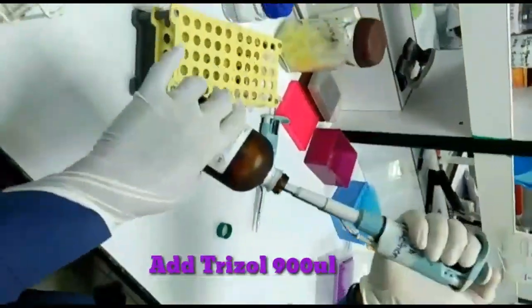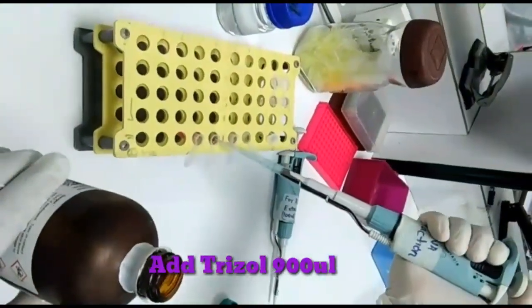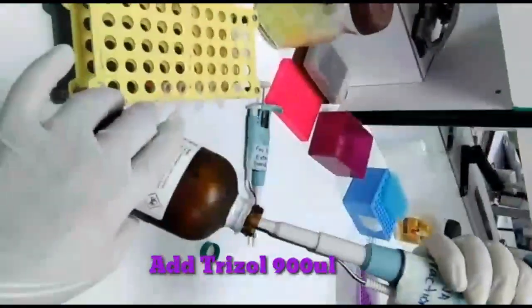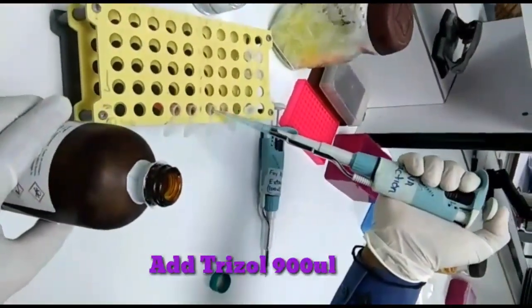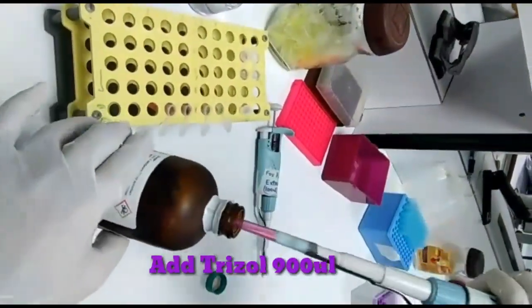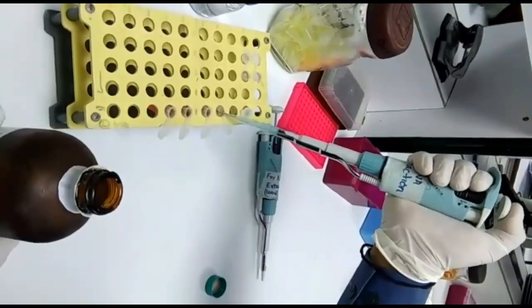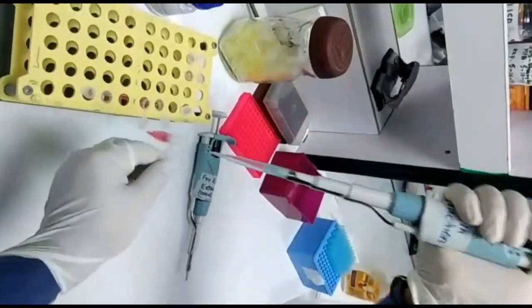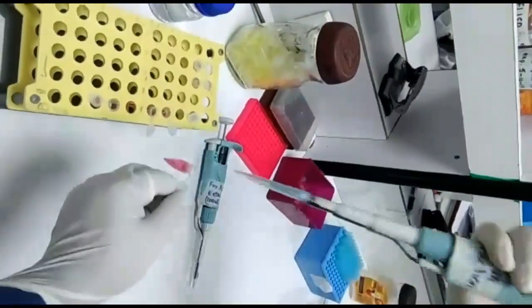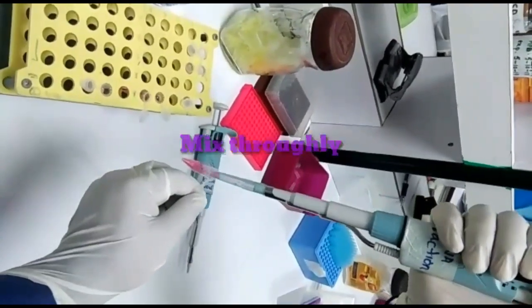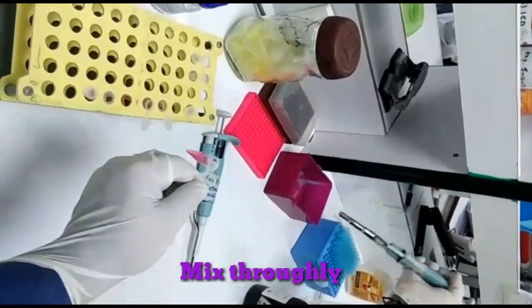Add 900 microliters of Trizol in each sample. We are adding 900 microliters of Trizol in each sample. Mix the Trizol and sample thoroughly.